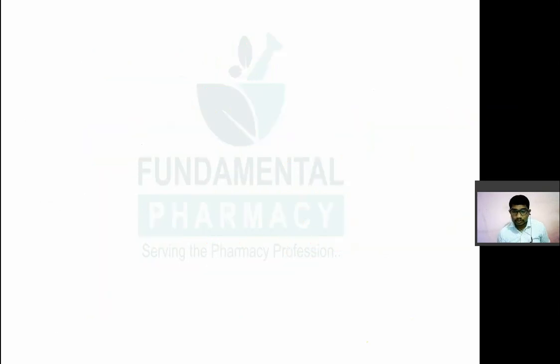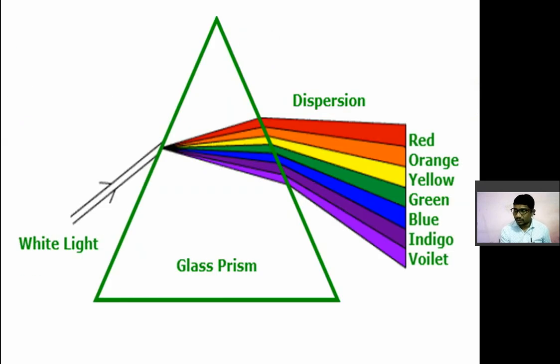So each and every spectroscopy deals with a single spectrum region. Like UV spectroscopy deals with only the radiations that fall in the UV region, 200 to 400 नैनोमीटर. The visible spectrum deals with only 400 to 800 नैनोमीटर. So in UV spectroscopy we use those radiations only.